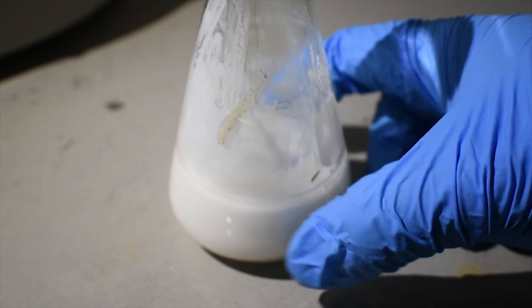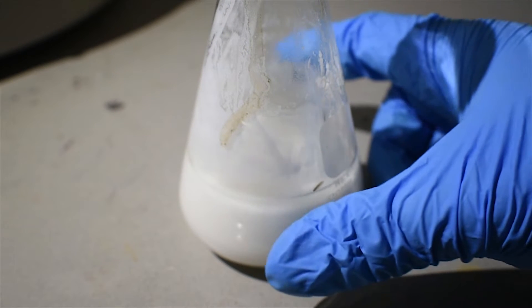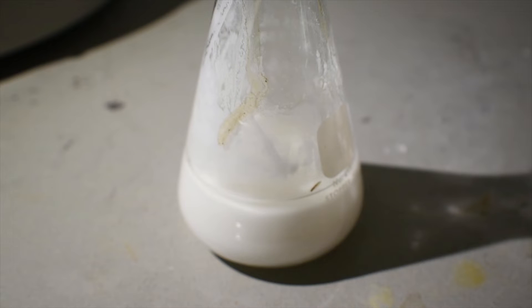The majority of the heat probably comes from the reaction forming the addition compound. What I'm going to do now is filter this, and we can dry it and observe the product.